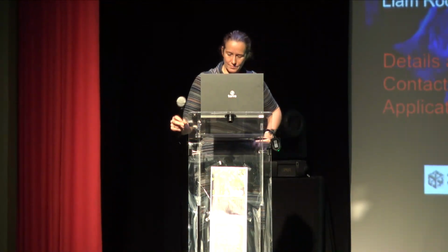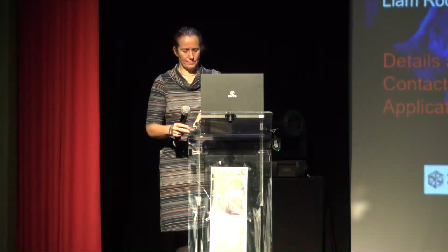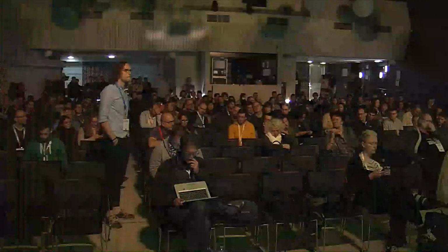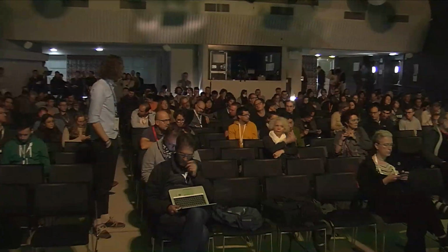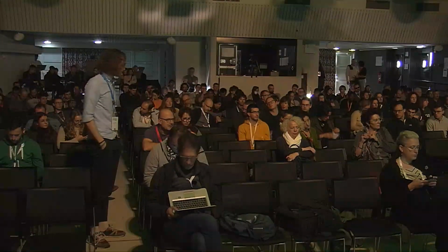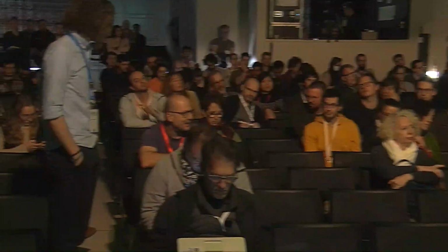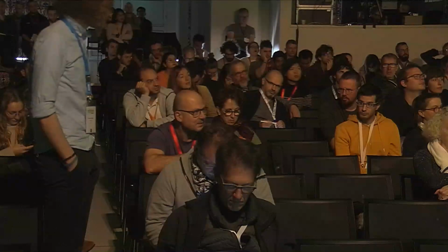Thanks a lot. I was pretty surprised, or startled, for sure. There's something I don't understand about the very low bleaching rate you showed. You mentioned that you are applying 4 watt, but of course it's a much larger field of view. If you could elaborate on that issue, because there are many things which are speaking against intuition and things which we are used to seeing in that context.